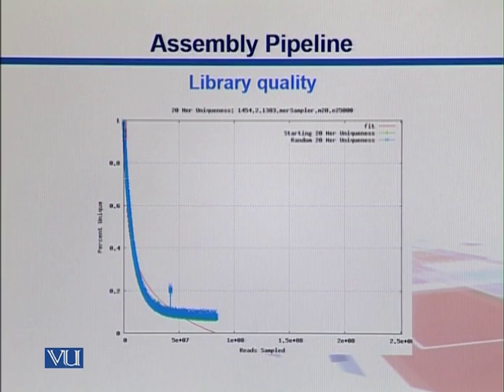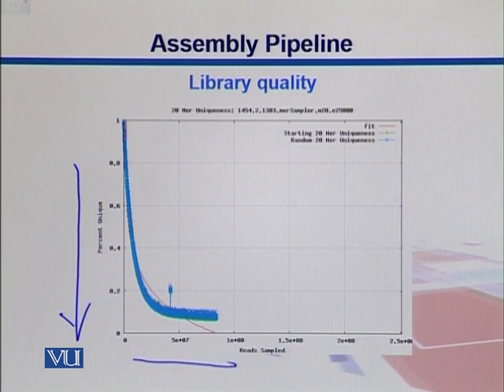If we plot the normal genomes, which are the good quality selected read data, we see the distribution looks like this. As we increase the number of reads sampled, the uniqueness comes down or decreases. This is an example of good quality data versus this one.